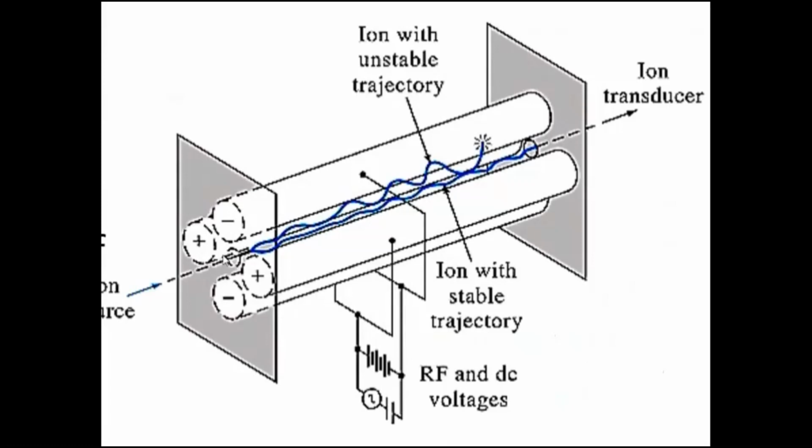So in the ion mix that is in between the rods, you have heavy ions and you have very light ions, and the frequency of changing of the voltage is very low. At this particular stage, there will be a certain path followed by the light ions and the heavy ions.